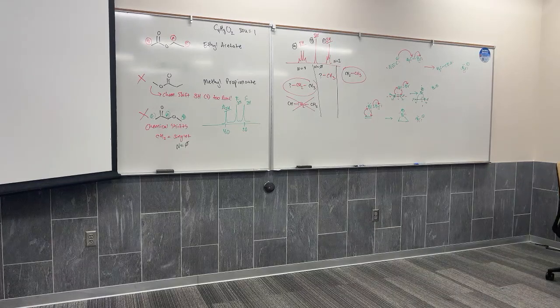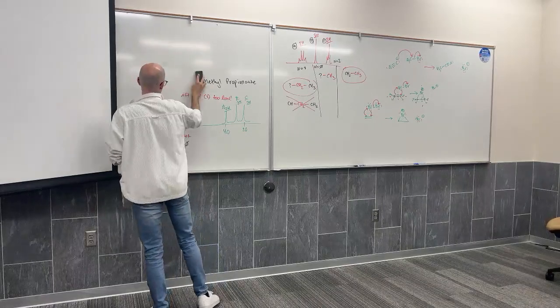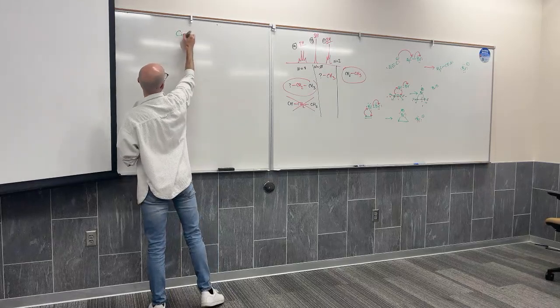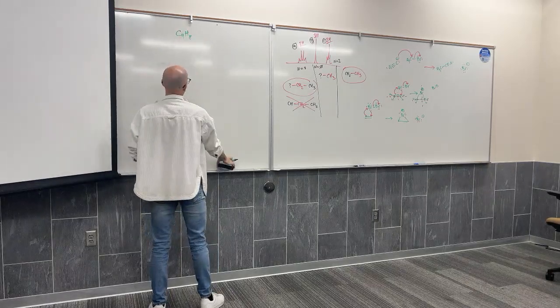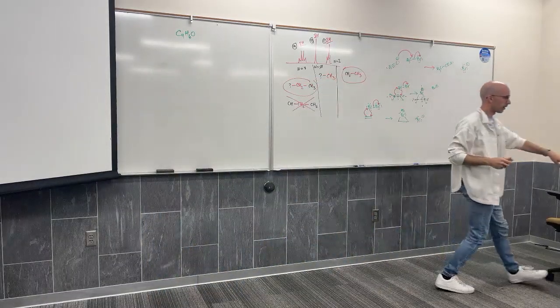All right, I think what I'm going to do is take screenshots of the IR and the NMR, and I'll put them both up on the screen. And then we'll go through them together. Here's the chemical formula, though, so that you guys can get started. Because the first step should be to calculate the degrees of unsaturation. So this is the chemical formula that we're working with.